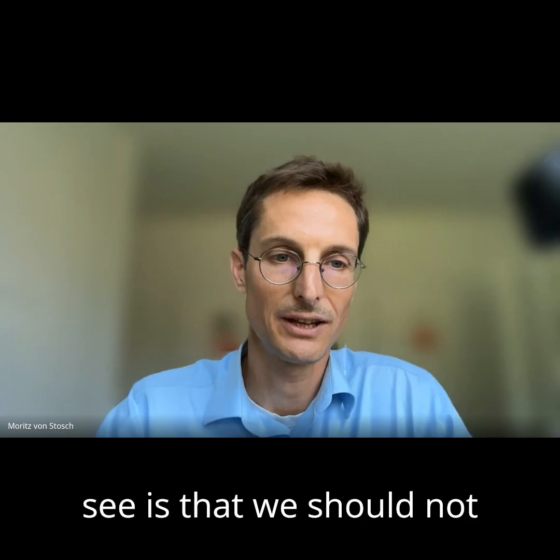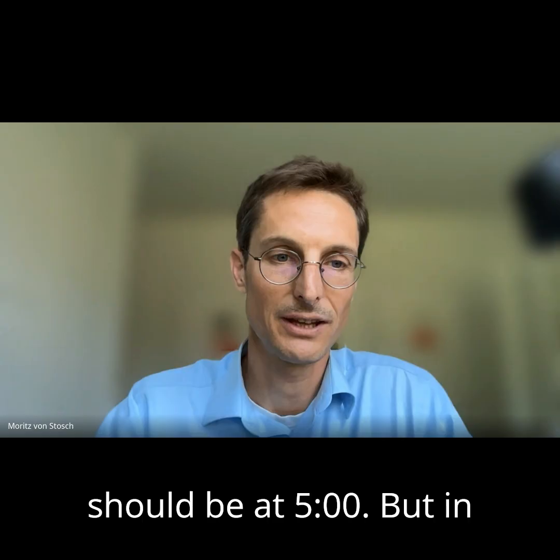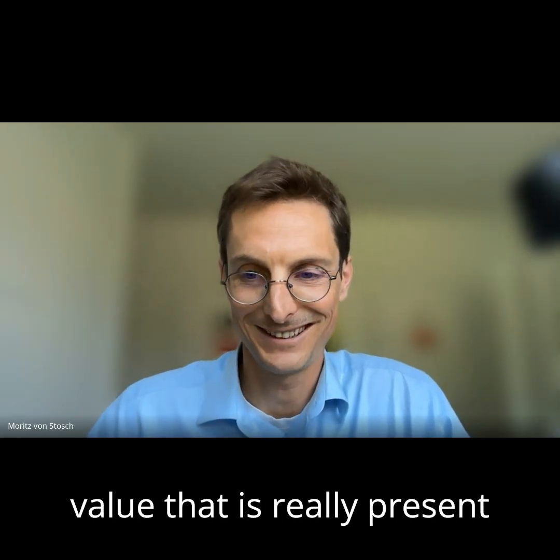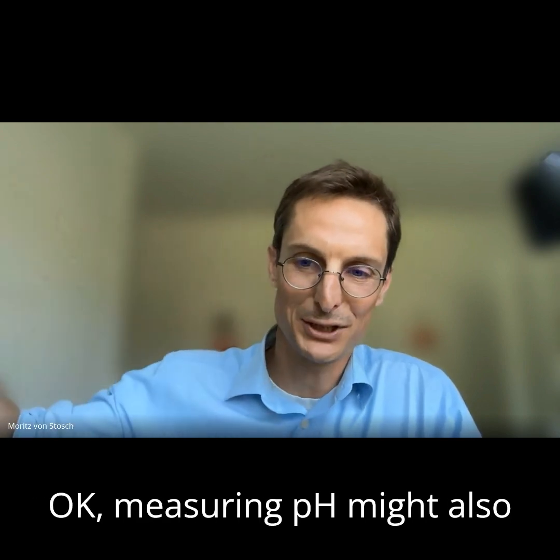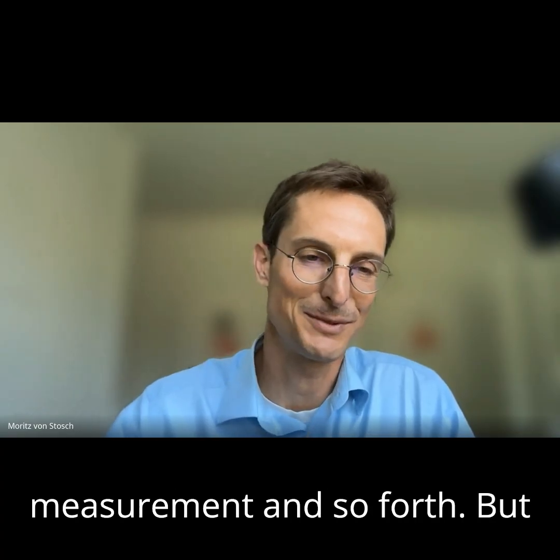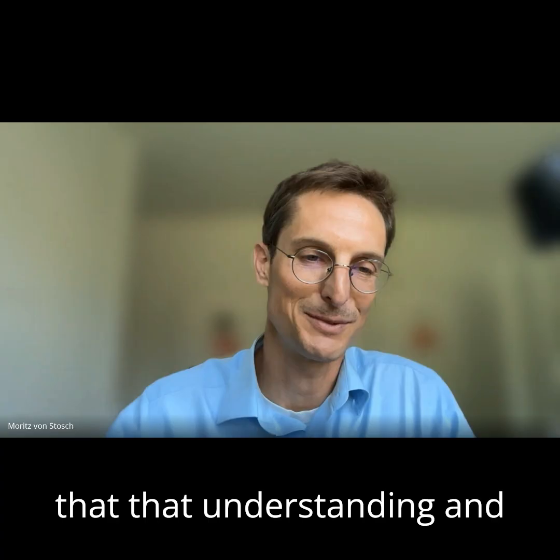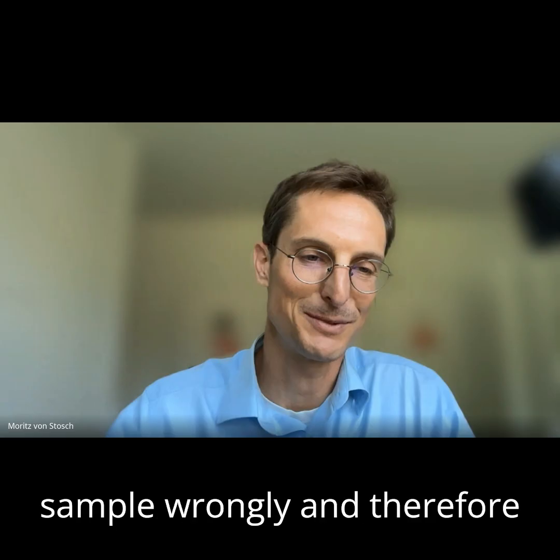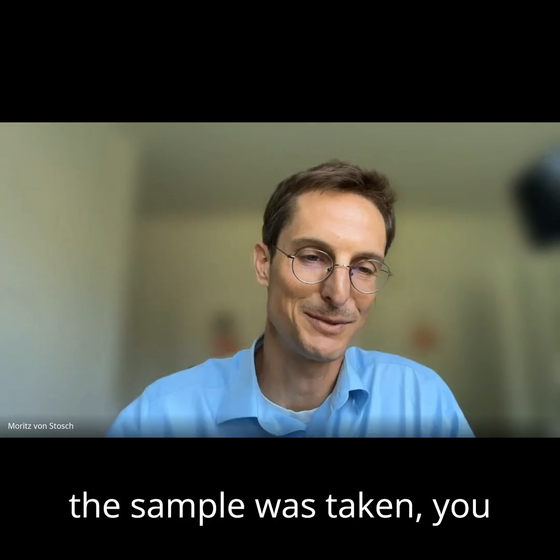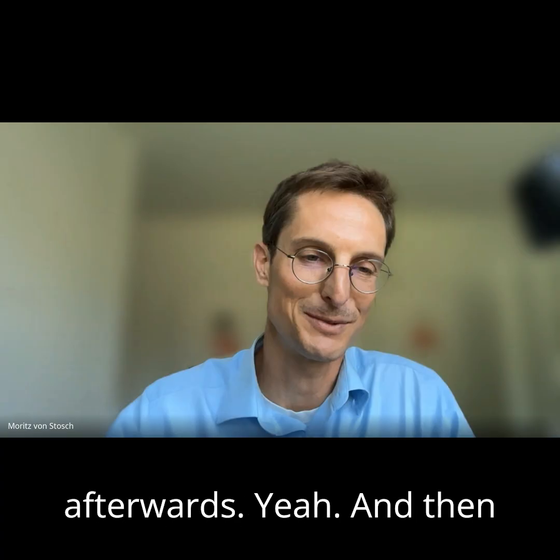Another thing that we also see is that we should not only record the values that should be. For instance, pH should be at 5, but in fact you want to record the value that is really present in the reactor. So you might want to measure pH, and measuring pH might also have to do with the calibration of the pH measurement and so forth. Then you might take a sample and label the sample wrongly, and therefore it is not entirely clear when the sample was taken, and all these kinds of things might impact the quality of the model afterwards.